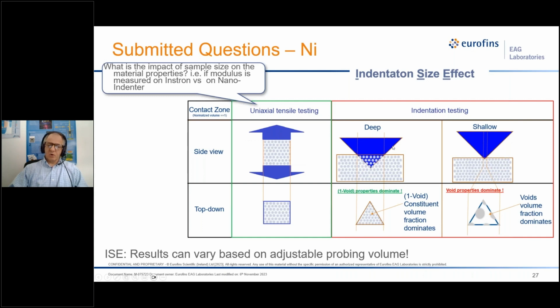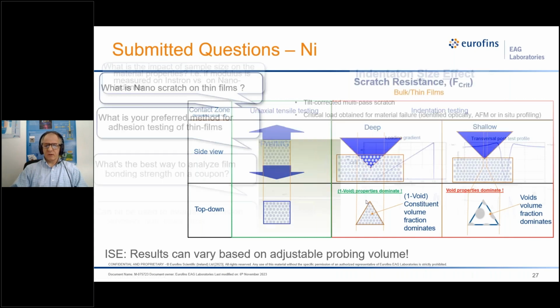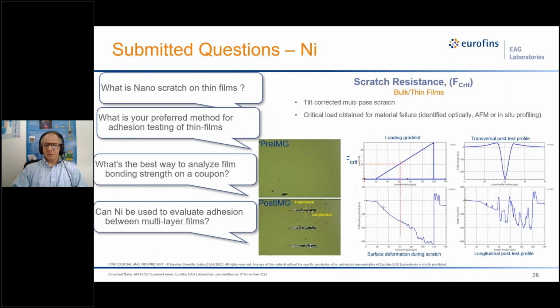Now, in order to get more comparable results, we could theoretically use a model to extract it, or probe larger volumes by simply penetrating deeper. So this is what this one represents. Now let me go to some application examples.